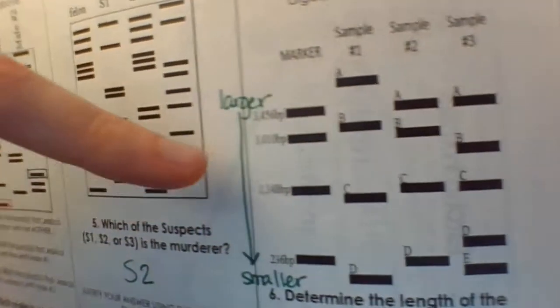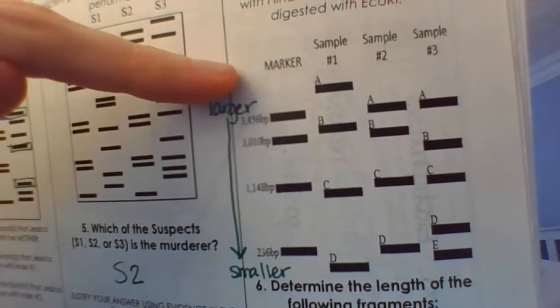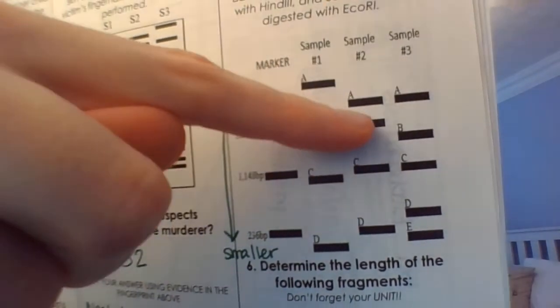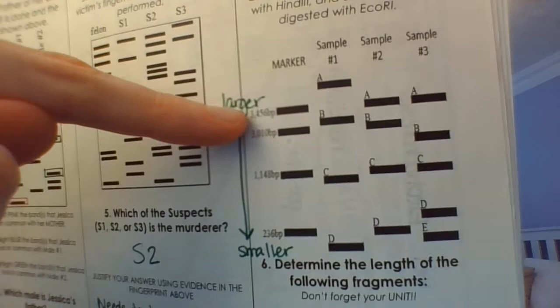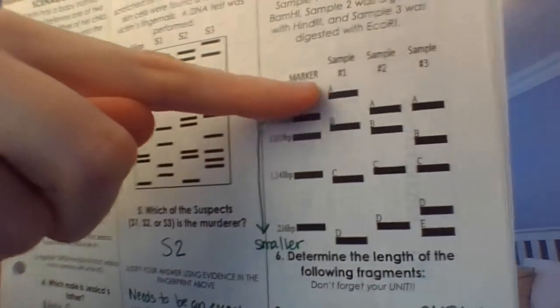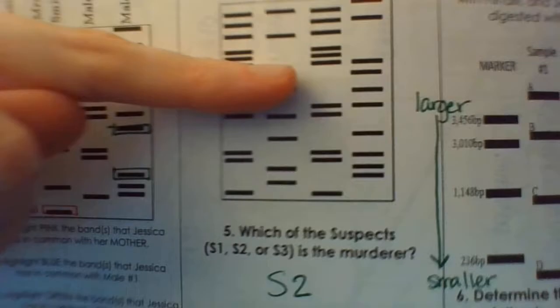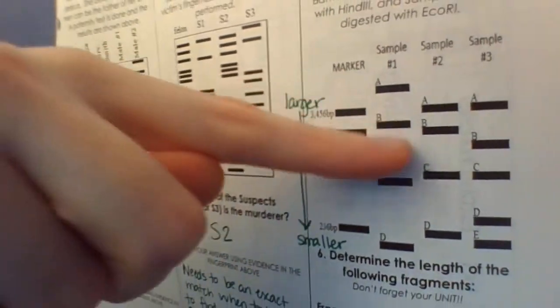And you know that because it's up here, so that means it's larger than this number. These two are the same as this number, and you're just going to keep using the markers, okay, to answer the question. So how many base pairs is this one? You know it's over 3,456. And you would just do that for all of them.